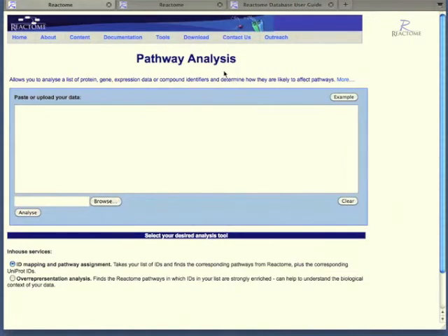There is an example button on the right. The example button can be used to load example data into the paste in window.